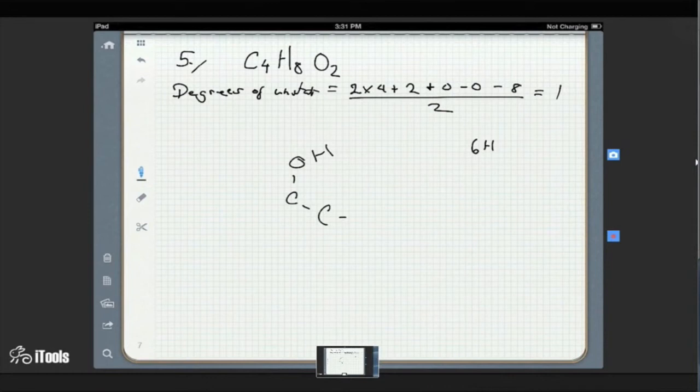12 ppm. What does that mean, to be at 12 ppm? 12 is aldehyde, which makes sense because there's 1 degree of unsaturation. Oh no, it could be a carboxylic acid. In fact, yeah, it has to be a carboxylic acid. Okay, so that's where our two O's come from then. So then you have two, and these have to be in the same environment too.